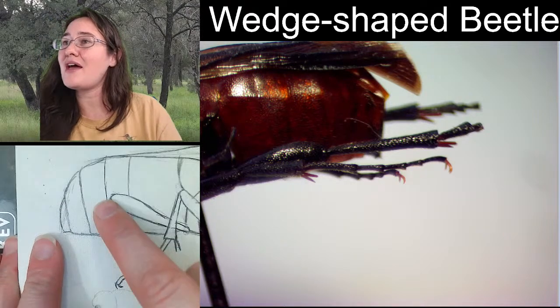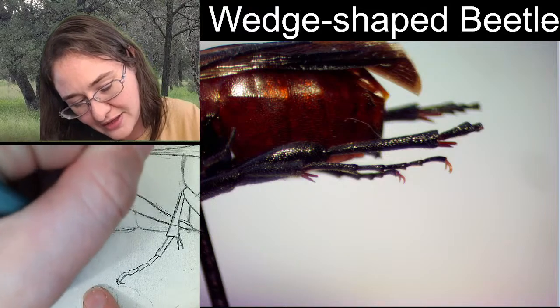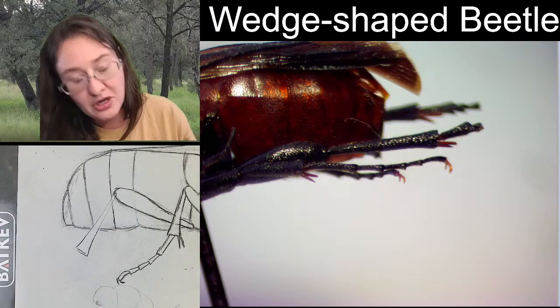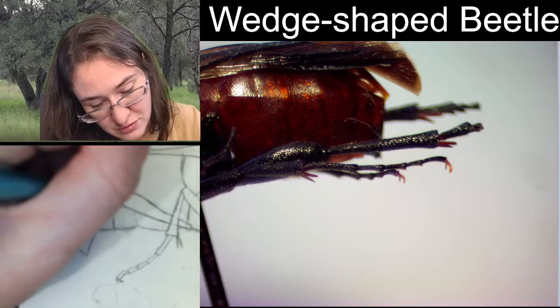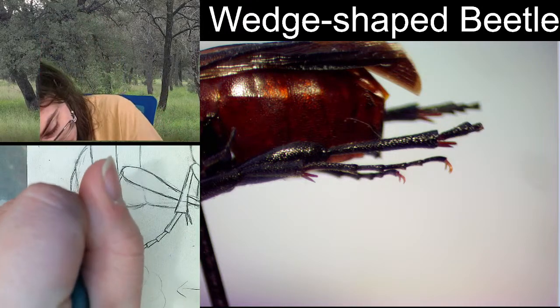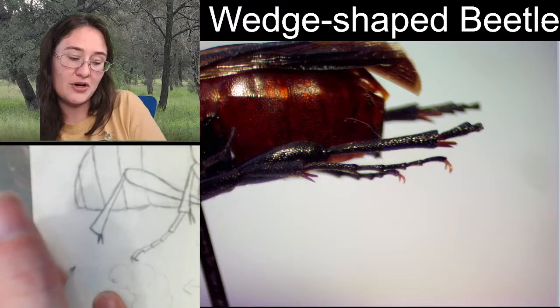And the tibia is nice and long, probably as long or longer than the femur. So it's going to be angled out more like this. It also is narrow at the top and gets wider at the base with two tarsal spurs. Here we go. And then we have four segments.